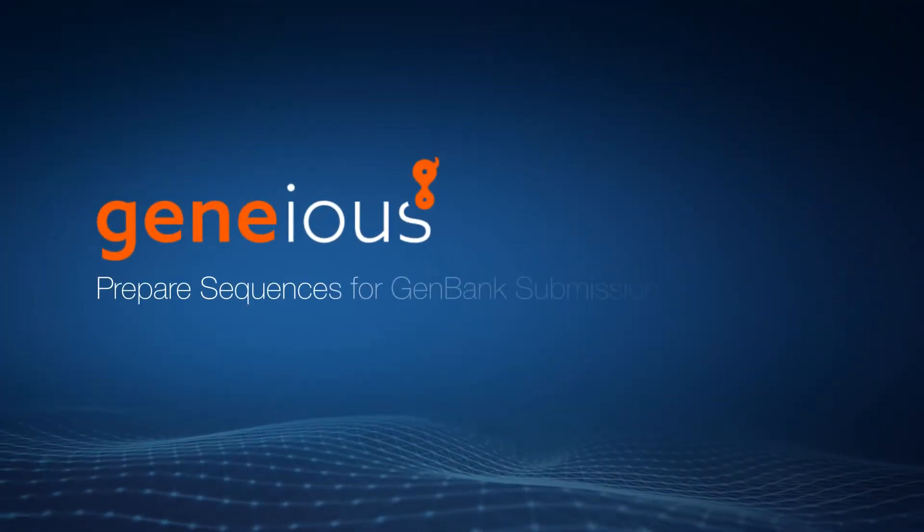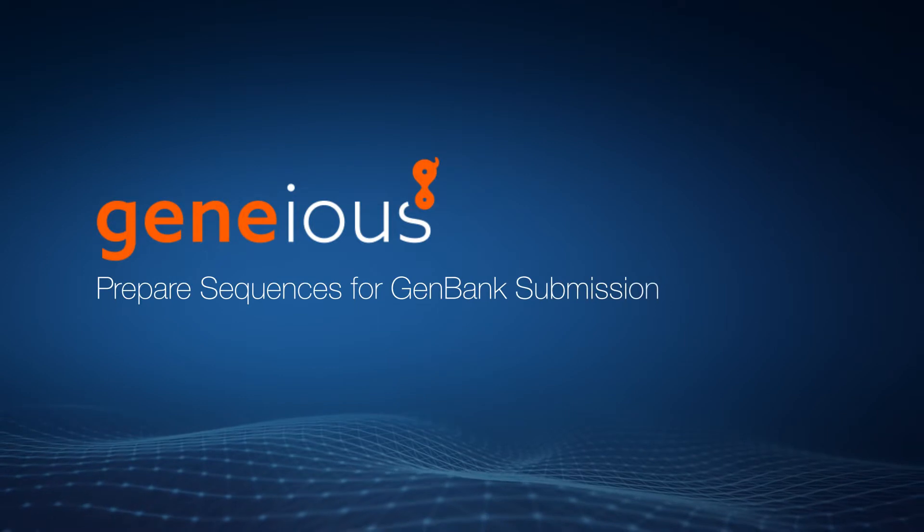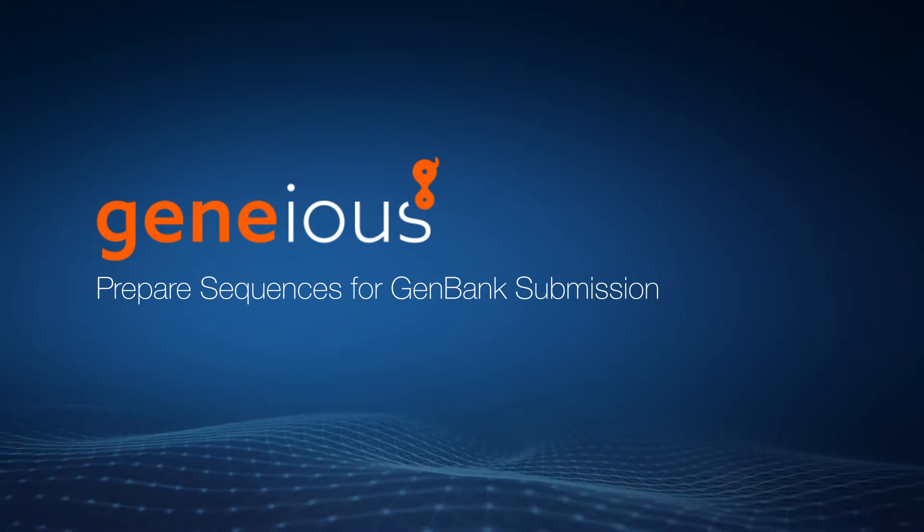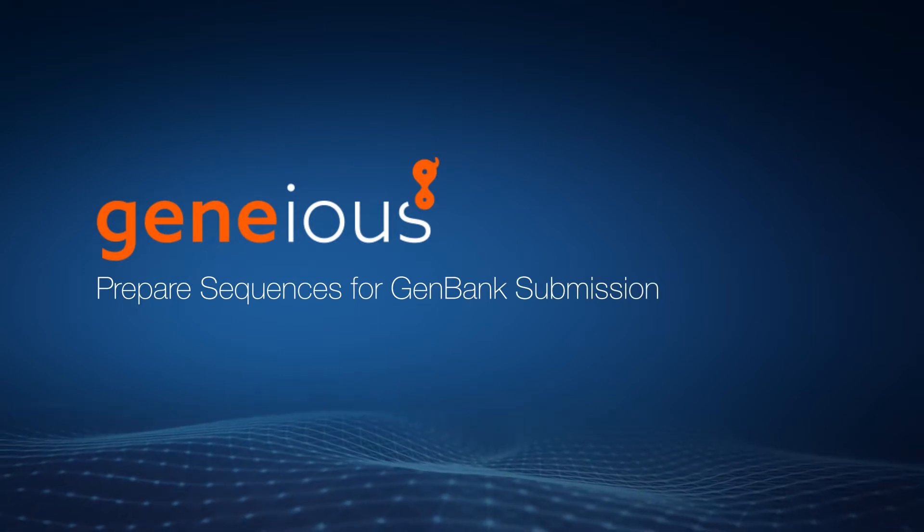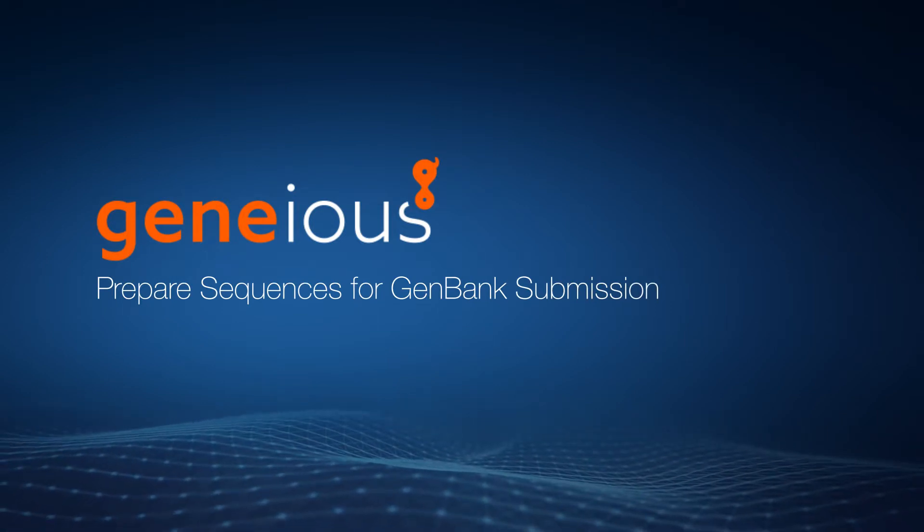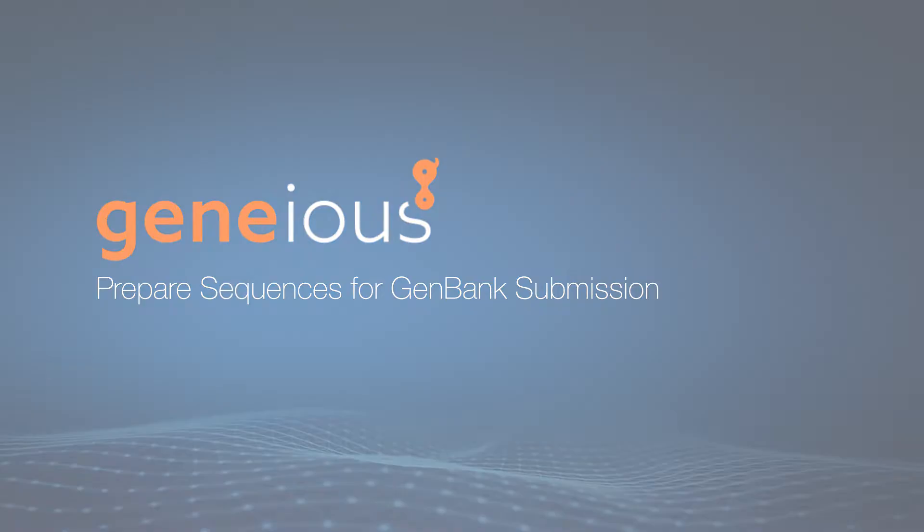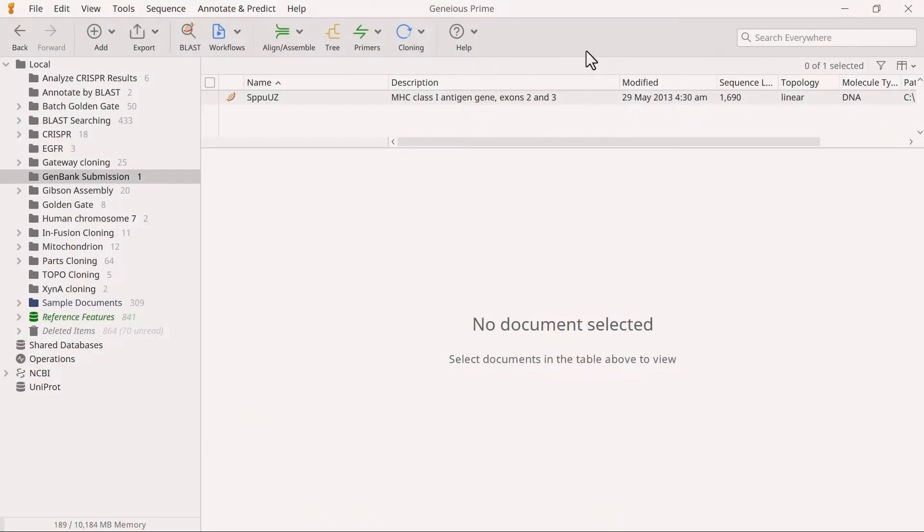Welcome to this video on preparing your sequences for entry to the GenBank database with Geneious Prime. The GenBank submission tool allows you to upload your sequences directly to GenBank from within Geneious Prime, retaining the annotations and features.